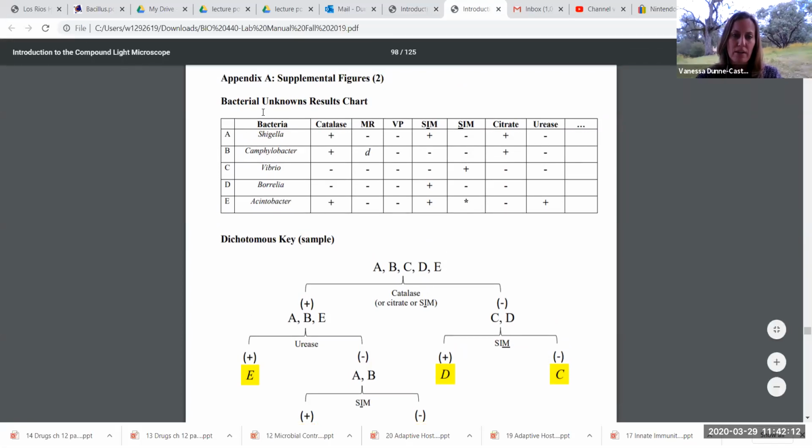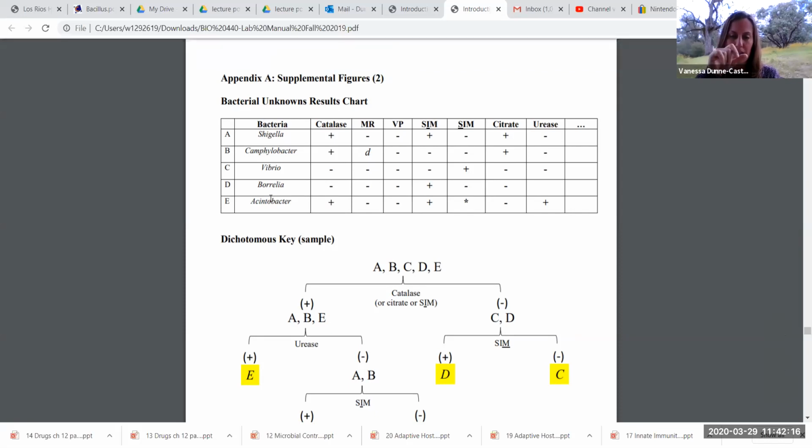So you'll write down the list of your narrowed down list of unknown organisms, either on the Y or the X axis of your table, or your row or your column. Identify your organisms with a 1-letter or 1-number designation, simple, to make it easier downstream when you're doing your dichotomous key.